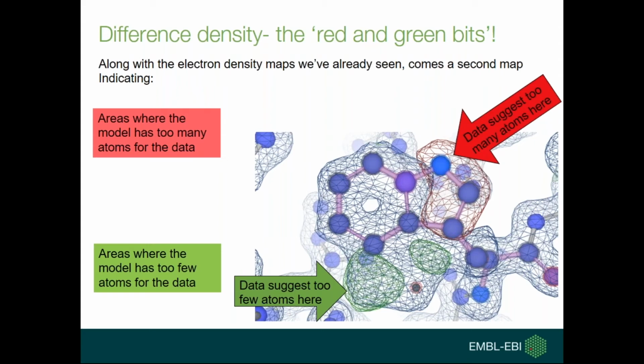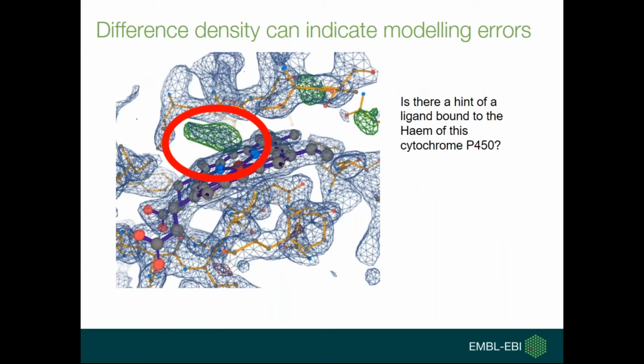In the case of this tryptophan, I hope you can see there's a very easy solution to this. It just needs turning round, and then it all fits marvellously well. But the difference maps are useful and instructive to look at sometimes.